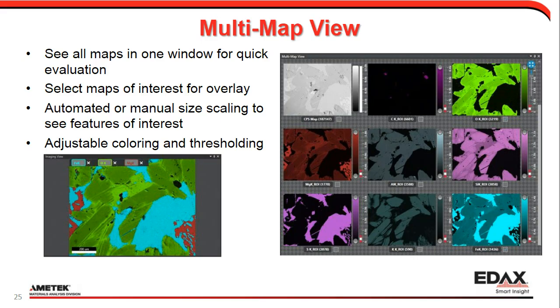You can see that there's a dark region in the center. That means there's a crack on the surface with very low intensity of X-ray counts. The variations due to topography can be compensated by applying a CPS normalization to the element maps.